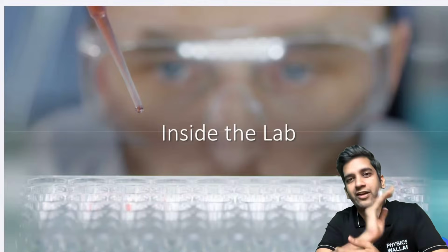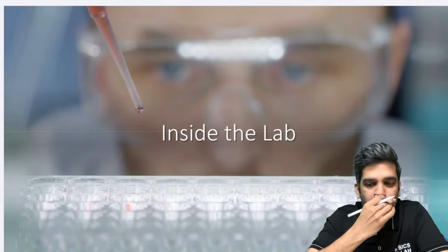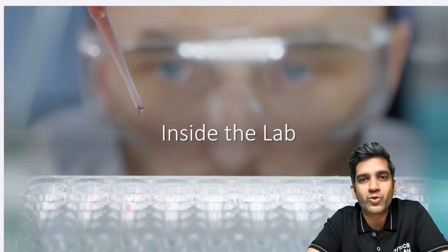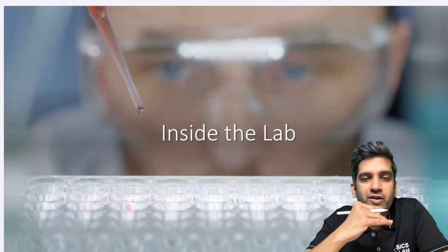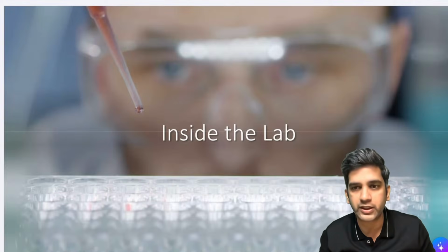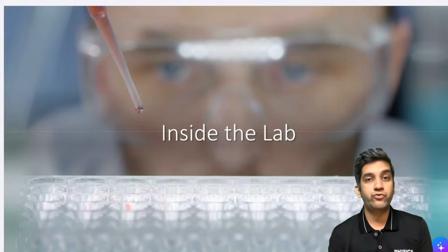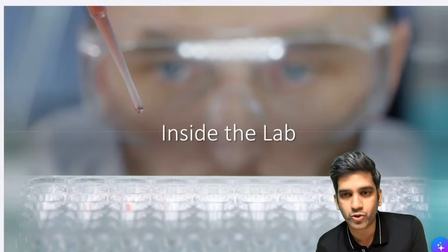I'm going to divert from the pathoclinics of the Decode CBC series, which we had for a couple of episodes last week. Based on your input, I'm going to show you what actually happens inside the lab. We have 4-5 videos or classes on this. The first thing we'll talk about is simple normal light microscopy, fluorescent microscopy, the variations of light microscopy. We'll also look at electron microscopy.